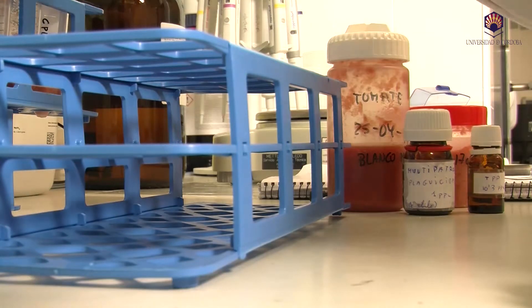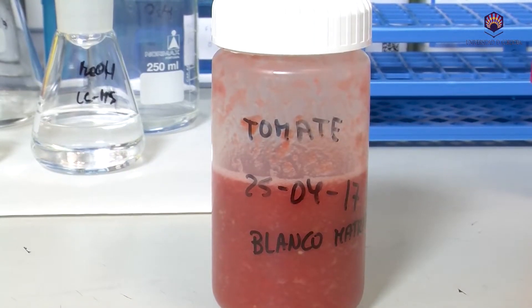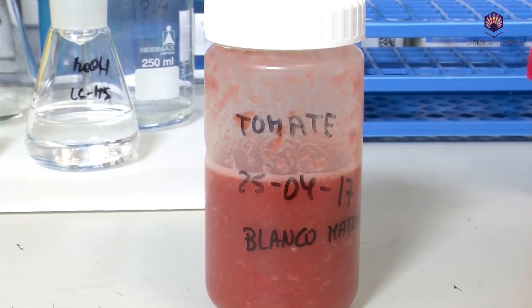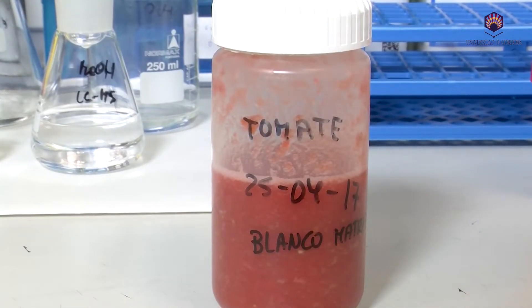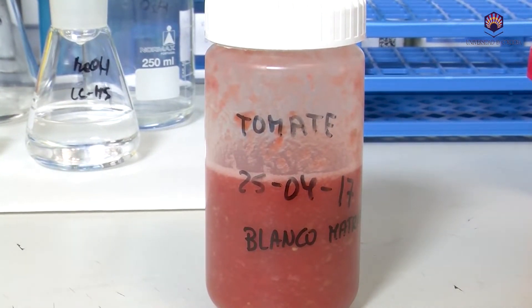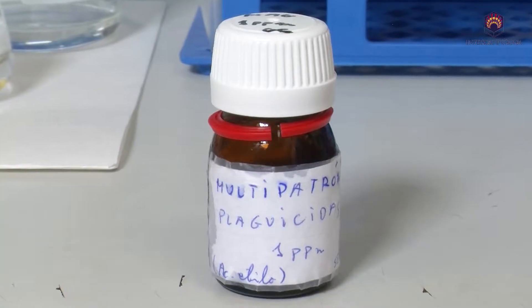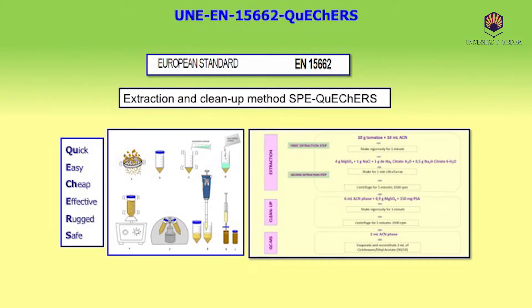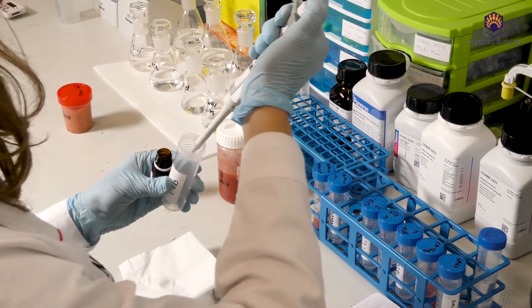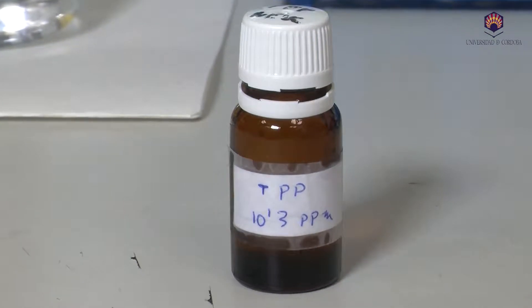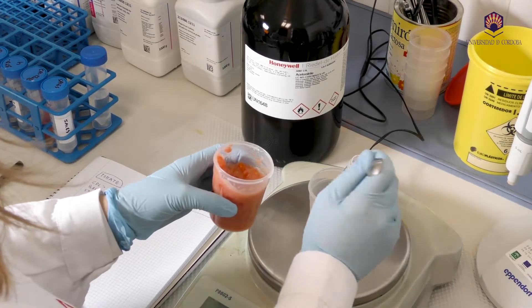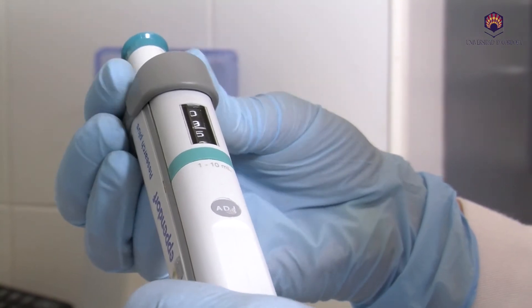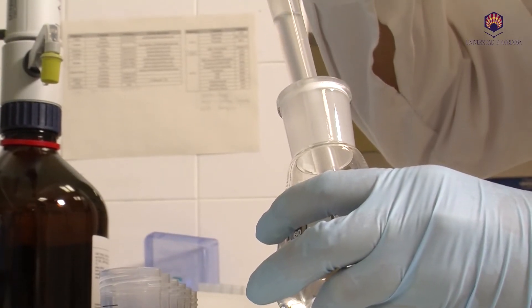To prepare the four standards of the calibration curve, we use a matrix blank — a tomato that has been previously checked for the absence or non-detection of pesticides — and add different volumes of a multi-pesticide calibration standard of one part per million, or ppm, depending on the calibration standard prepared. The extraction and cleanup procedure carried out is the dispersive SPE, solid phase extraction, QuEChERS. Firstly, in the extraction tube, we add 100 microlitres of a solution of 10 ppm of triphenyl phosphate, our internal standard, then we weigh 10 grams of sample and add organic solvent — in this case, acetonitrile. It is shaken to enhance contact.